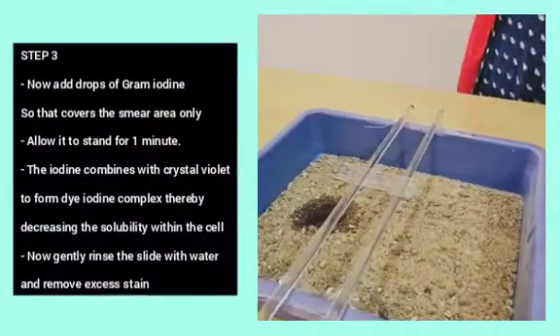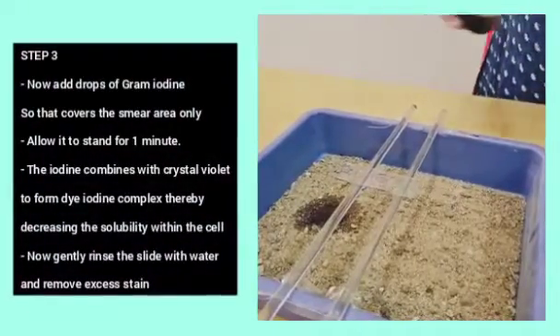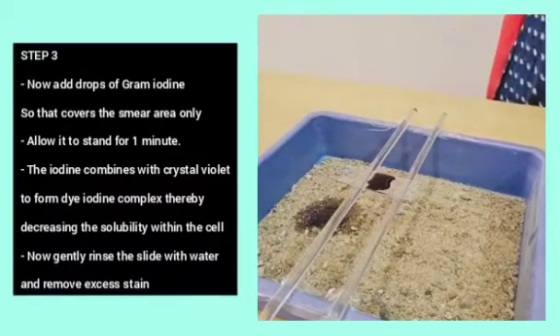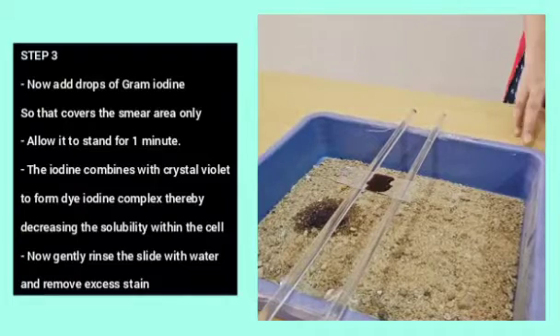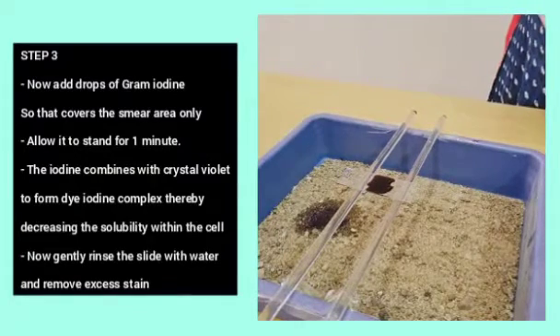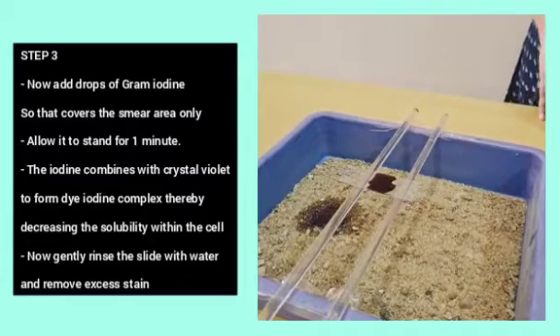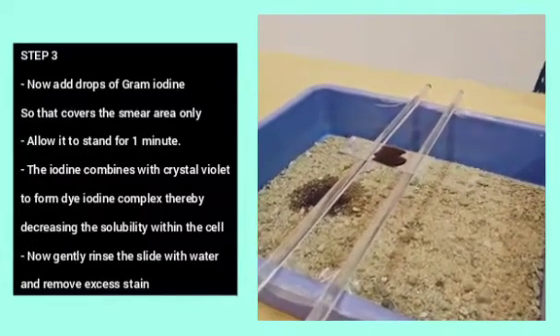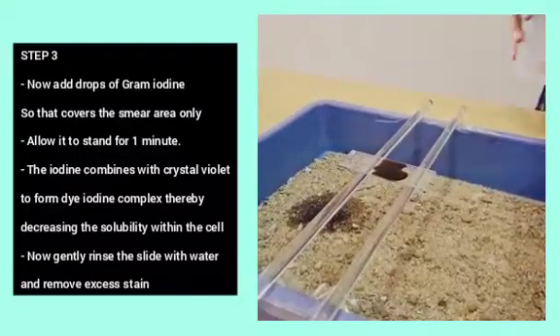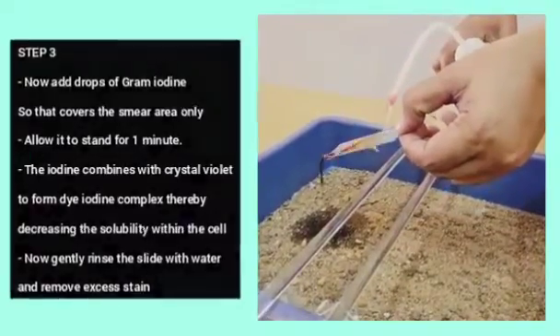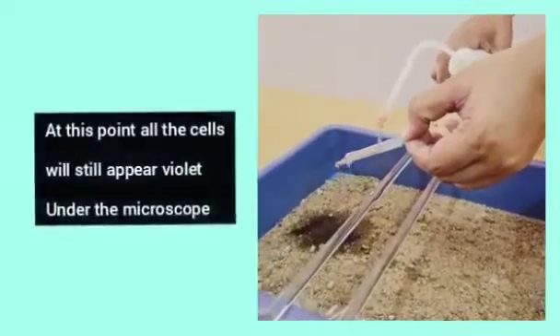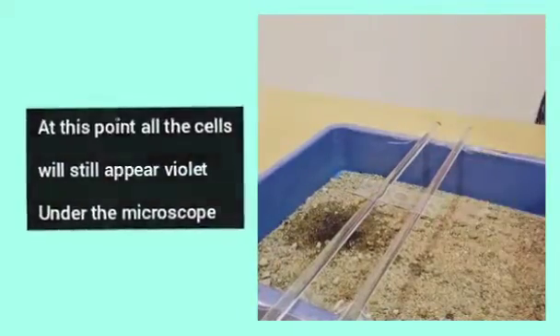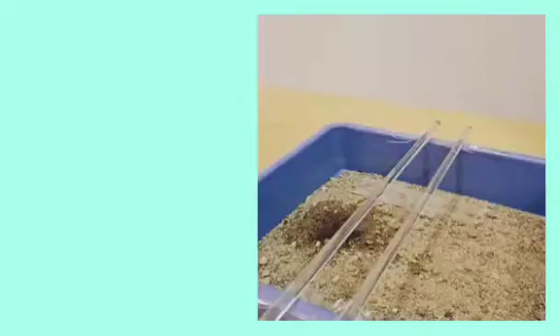Step 3. Now, add drops of grams iodine so that it covers the smear area only. Allow it to stand for 1 minute. The iodine combines with crystal violet to form di-iodine complex thereby decreasing the solubility within the cell. Now, gently rinse the slide with water and remove the excess stain. At this point, all the cells will still appear violet under the microscope.